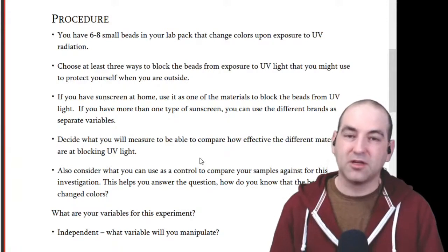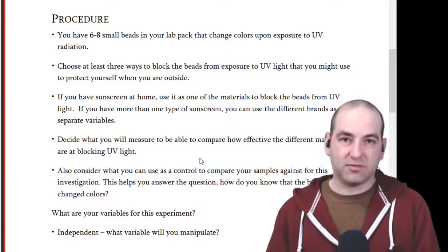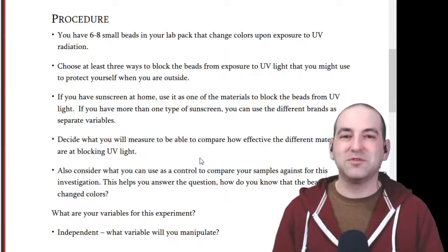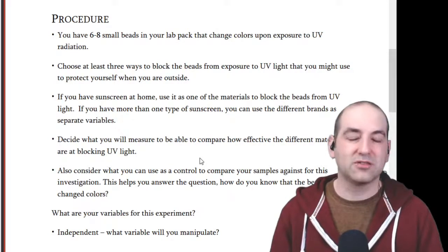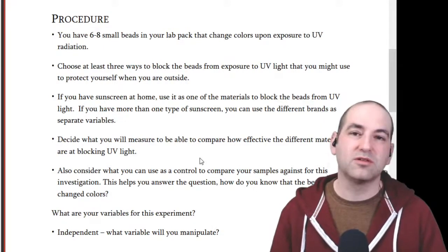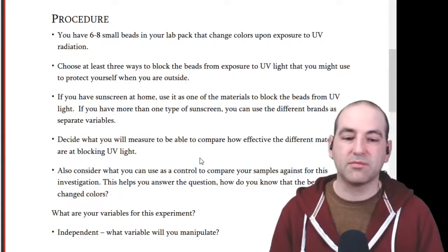But once you've got that dialed in where you have a procedure that seems to do this, do it again. And this time, try to follow exactly what you wrote down as a procedure once you've developed it as a good procedure, and then do it again and do it again, or however many times you can, or enlist somebody else. Maybe somebody else in your family can follow your directions. If you've got kids around, they like doing this kind of stuff. That might be fun. And you can say, hey, can you reproduce my results, or do you get different results? You can talk to other people in class and see how your results compare.